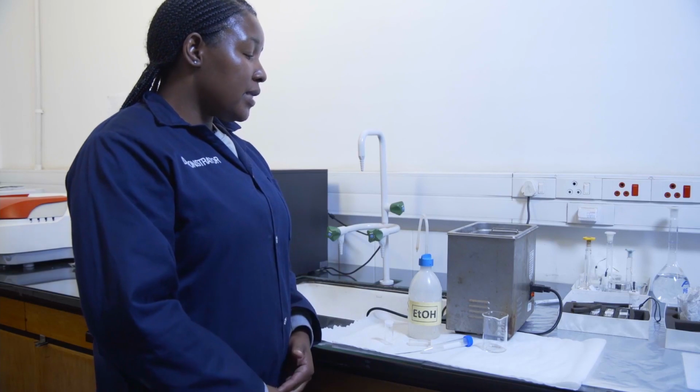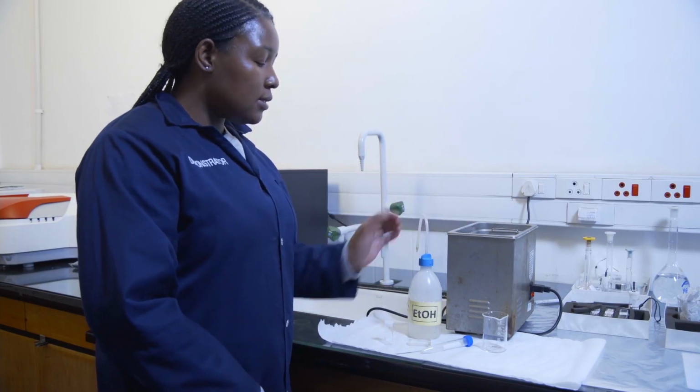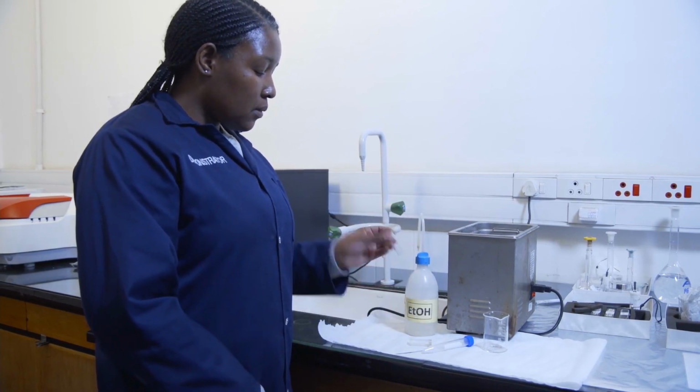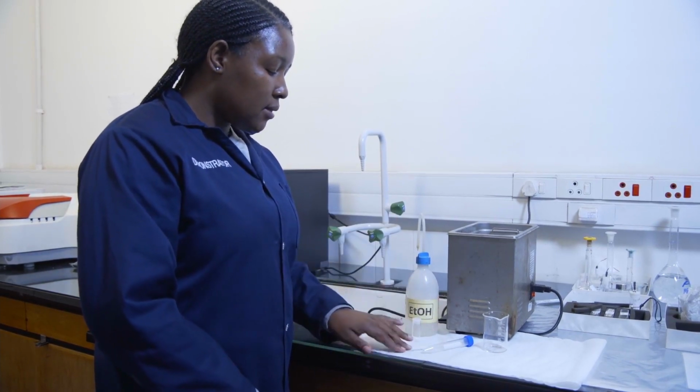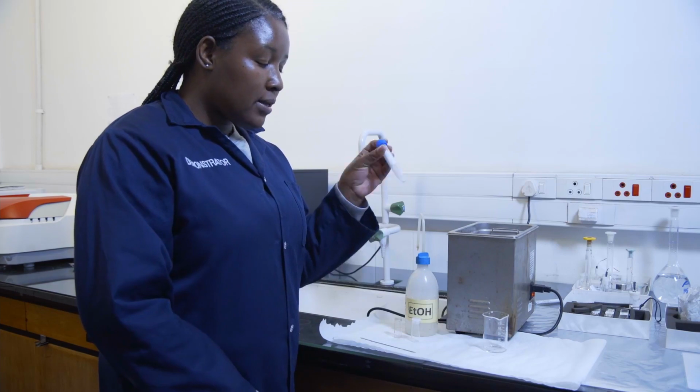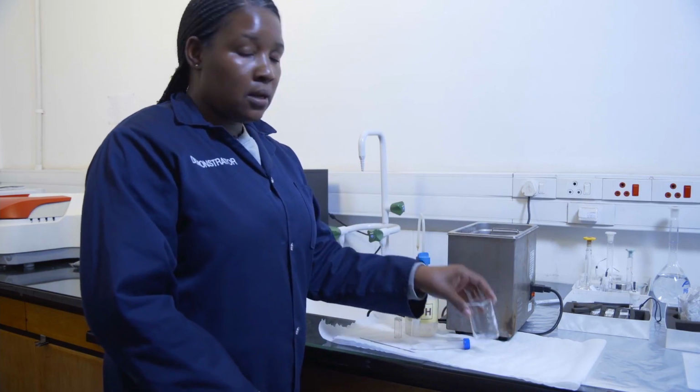In this part of the experiment, the absorption peak of the zinc oxide nanoparticles in ethanol will be determined using a UV-Vis spectrometer. For our sample preparation, we are going to need a sonicator, absolute ethanol, a cuvette, a vial, a spatula, our zinc oxide, as well as a beaker.